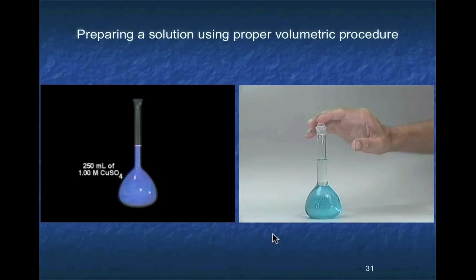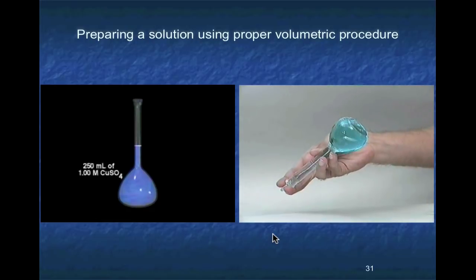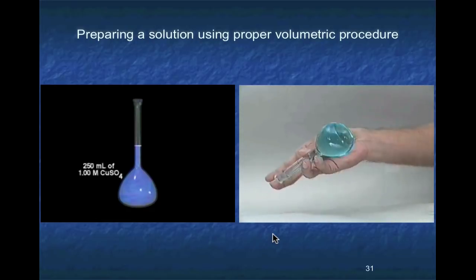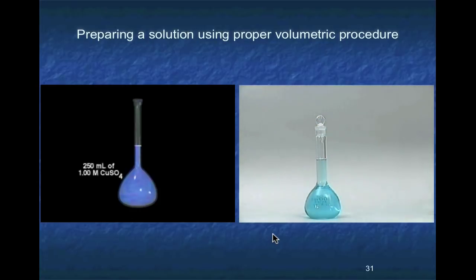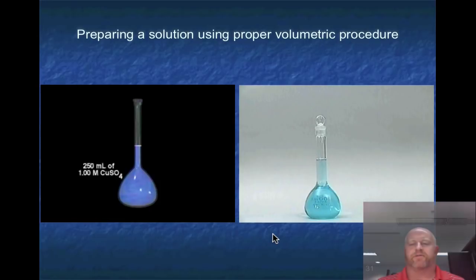Insert a stopper and mix the solution by inverting it. If you don't mix after you add that last bit of water, what will happen is in the top side of your solution, you'll actually have a less concentrated form of your solution. It'll be more concentrated towards the bottom. So once you get to the volumetric flask, you want to make sure you do a last set of mixing to get all that solution completely mixed evenly so the concentration is even throughout.